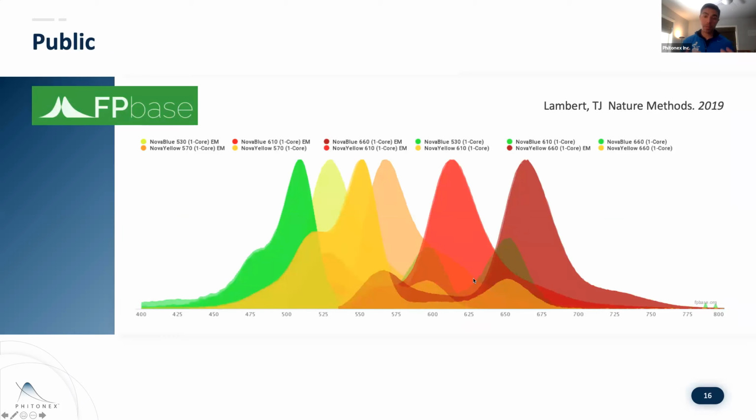So we took these spectra, we published them up on this open source resource called FPbase, which is a really nice resource for looking at spectra, right? And it's free. You can also compare the labels if you're using experiments, for instance, where you want to use this in GFP or RFP or any of the other labels. All the data is in there. So a really nice resource.